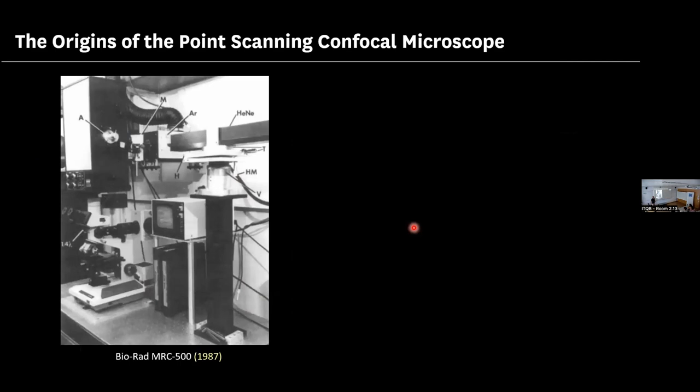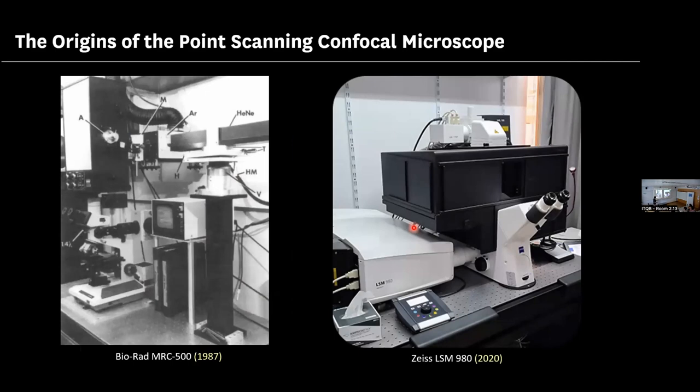And you can compare with a confocal microscope today. This is one of the confocals that we have at IMM. There's been a huge advance in terms of technology. A lot of things happened: lasers, fluorescent dyes, electronics, and that made the confocal microscope the most versatile tool still today. I mean, as we've seen, there are a lot of imaging techniques developed in the last years, breaking the barriers of resolution in space and time. The confocal microscope is still the most used microscope in all imaging facilities that have a large scope of usage, I would say. And let's see why, let's see how it happened.